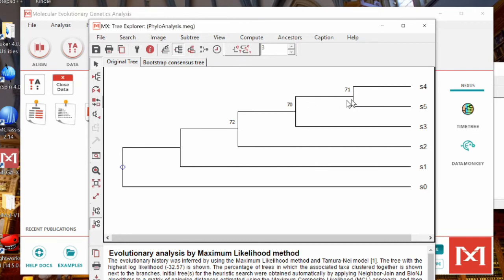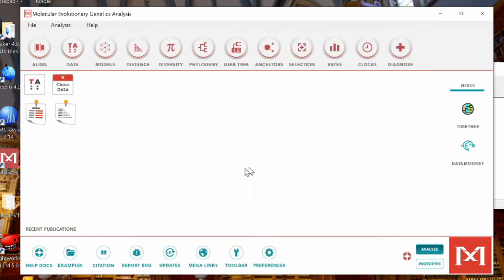And here there's a 71. Here I don't see the number. Most likely it's something technical. But these numbers are telling us that this reconstruction is statistically reliable, and it perfectly makes sense. The branch lengths represent the number of variations in here, but in the reversed order. So we got so many variations in this sequence.